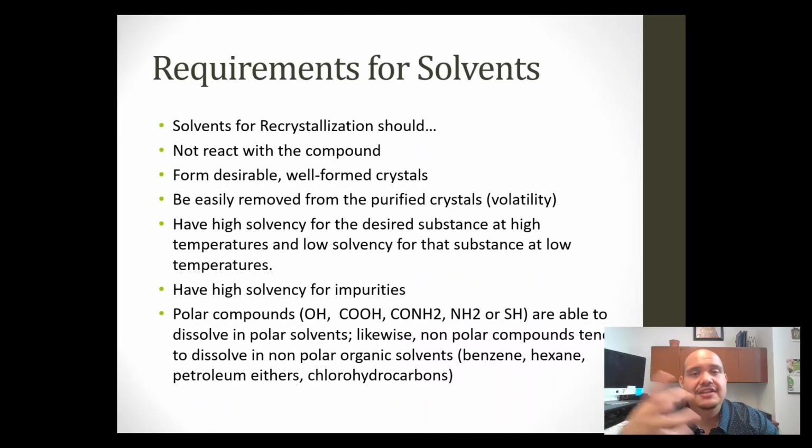If it does, you won't be able to retrieve it back. You might be able to take a solute that was solubilized in, for example, diethyl ether, right? And now it's got this diethyl ether that has a super low boiling point, like 33°C, something like that. You put that on a hot plate and you can vaporize away all of your ether. And what's left would actually not be a crystal. It would be a precipitate, because you're precipitating that stuff back out. So you can save a solute like that if you put it into something that's super, super volatile.